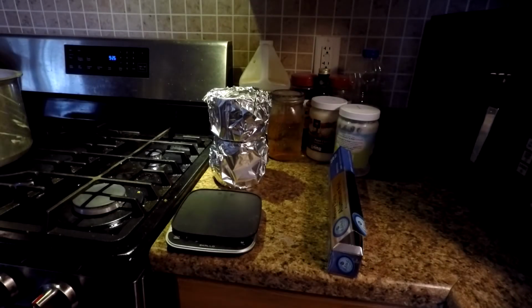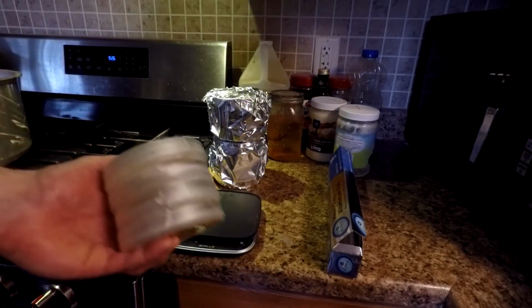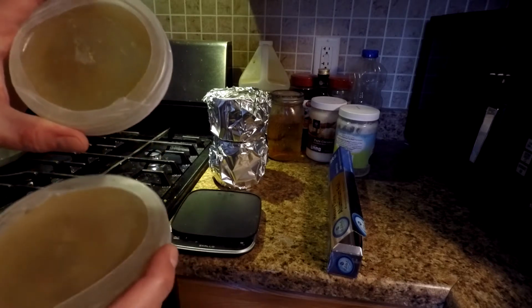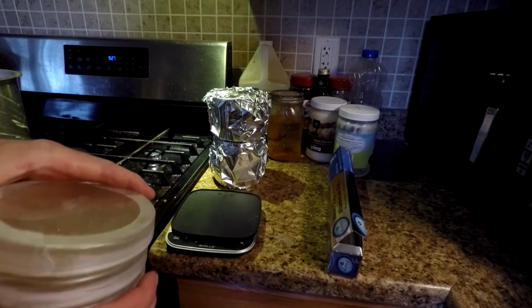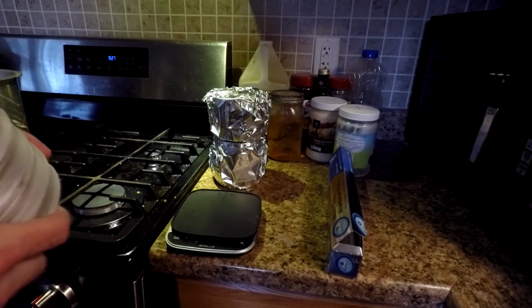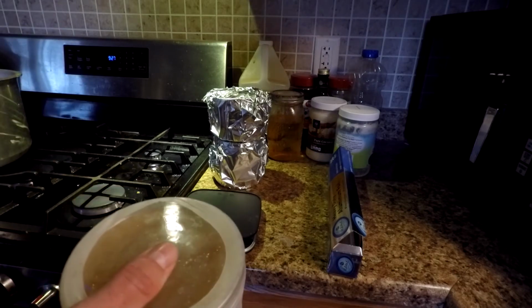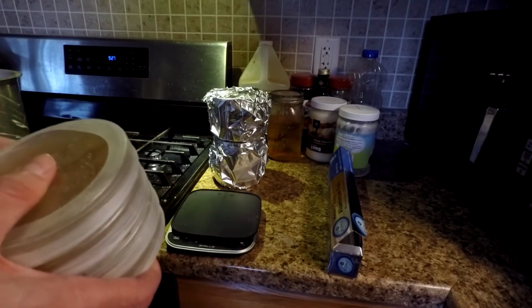Good morning, everyone. Well, it looks like this method of trying to use a spore syringe directly on the agar isn't going to work. I got these 4 dishes that I made up the other day, and already in the streaked area, it created bacterial contamination again. So what I have to do, not only thinning the spores, which I'm going to do with an inoculation loop today, and I've already done a couple dishes this way a few days ago, but I haven't done some other factors to make them work better.